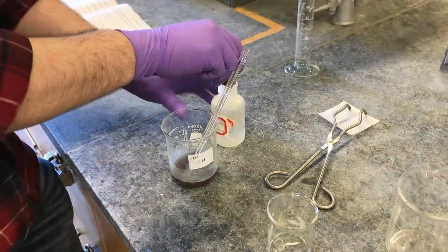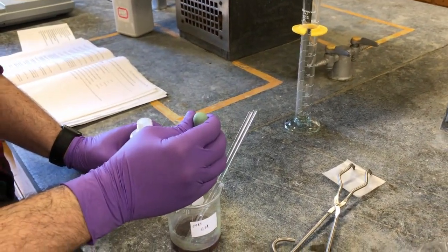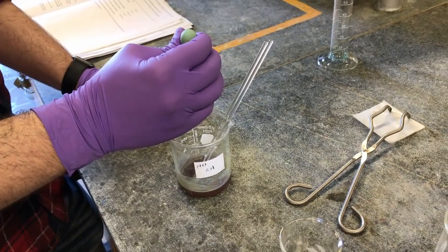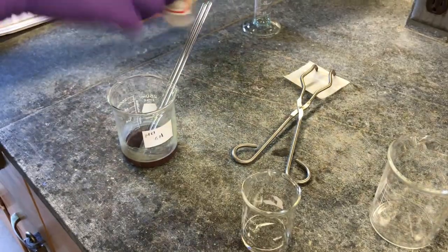So right now we're going to add about 10 drops of hydrochloric acid to our beaker. And we're going to stir that pretty good.